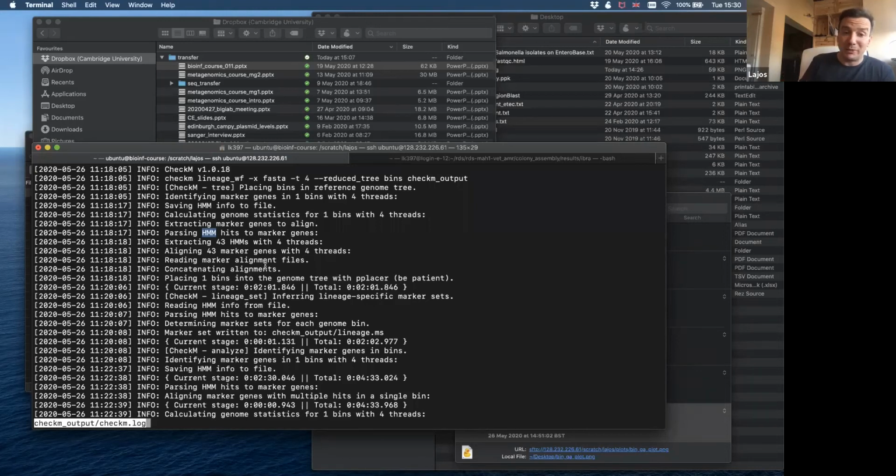If something is missing, then you have to start thinking about maybe there was something wrong with your sequencing, there was something wrong with your DNA extraction, or there was simply something wrong with your bioinformatics pipeline when you are at this point.